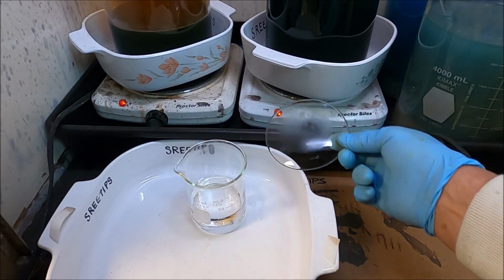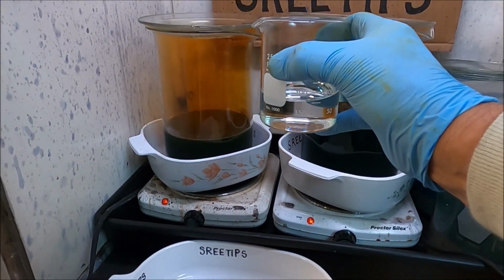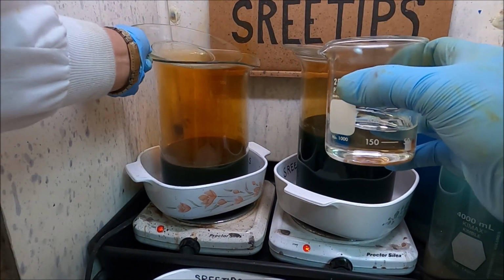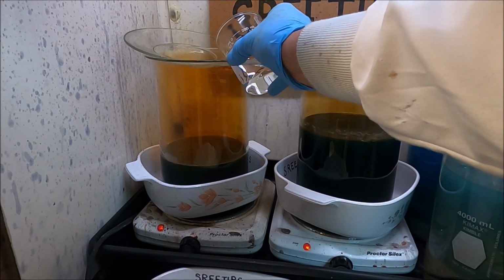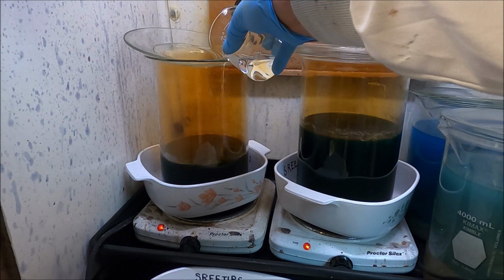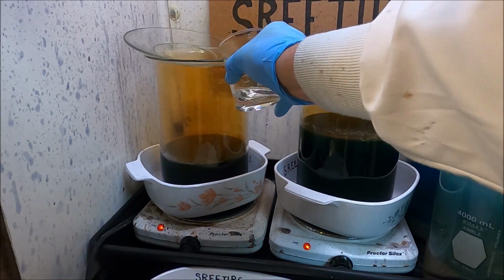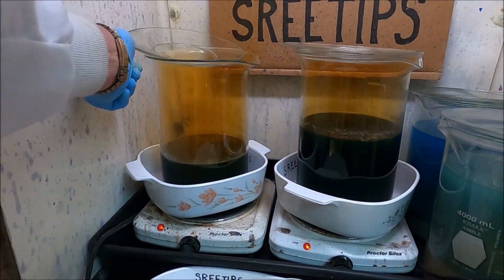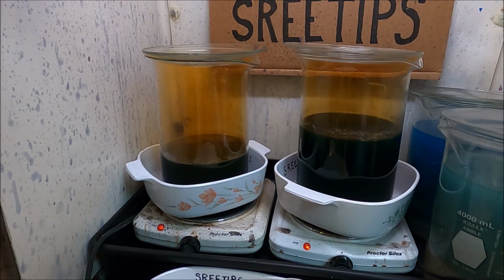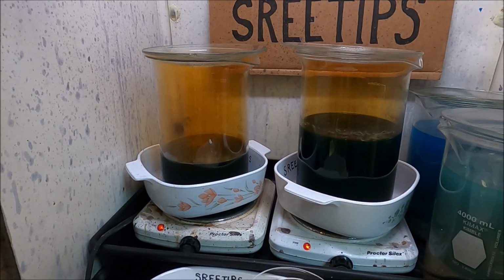Alright, now we're going to see if we can get a little bit of this acid into this larger beaker up here. I'd like to get most of this in there without creating a boil over here. That's as far as we want to go. I see it start fluffing up like that. That tells me, that's the beaker telling me to back off. So I listen to it so we don't get interruption and have silver nitrate solution all over.